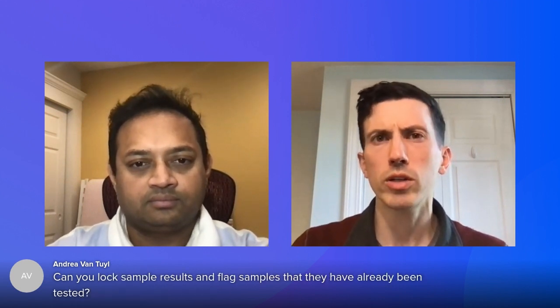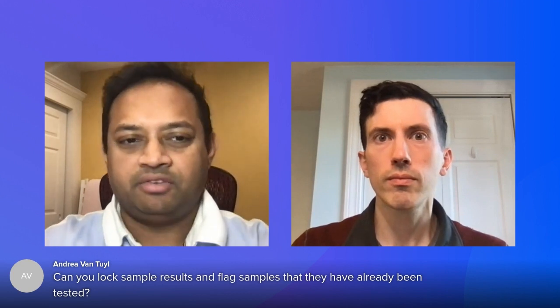Yeah. So the curve fitting right now is a very active area of development for us, and I had shown you a logarithmic regression for EC50 calculations. You can do things like linear regression, and there's also heat maps. You can create some heat maps based on the data that you have, and so that would be current state, and this is an area of active expansion, though. So it depends on what you're looking for. Exactly. We are building many more scientific analytics tools on the Benchling platform, but we have some of the core functionalities that scientists might need for bioanalytical.